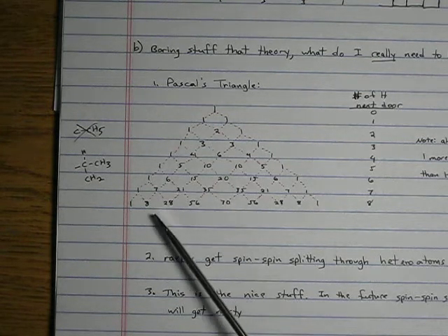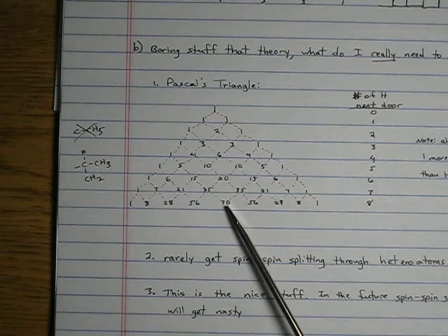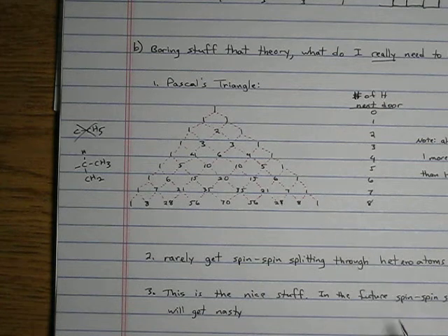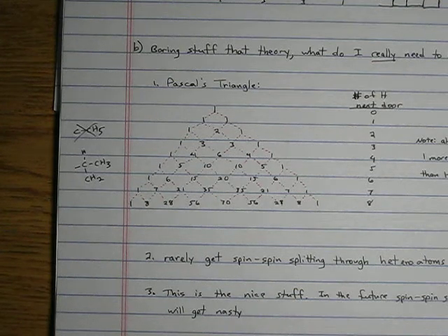Let's look at this last one down here. If you were to have 8 hydrogens next door, the tallest peak in this multiplet is going to be roughly 70 times taller than the outer peaks. But altogether, all 9 of these peaks, when you add up the area underneath, is probably only going to integrate to 1, if there's only one hydrogen causing the signal. So when you get these crazy multiplets like this, it's often very difficult to tell the exact number of hydrogens next door, because these little peaks at the end might not exactly be visible.